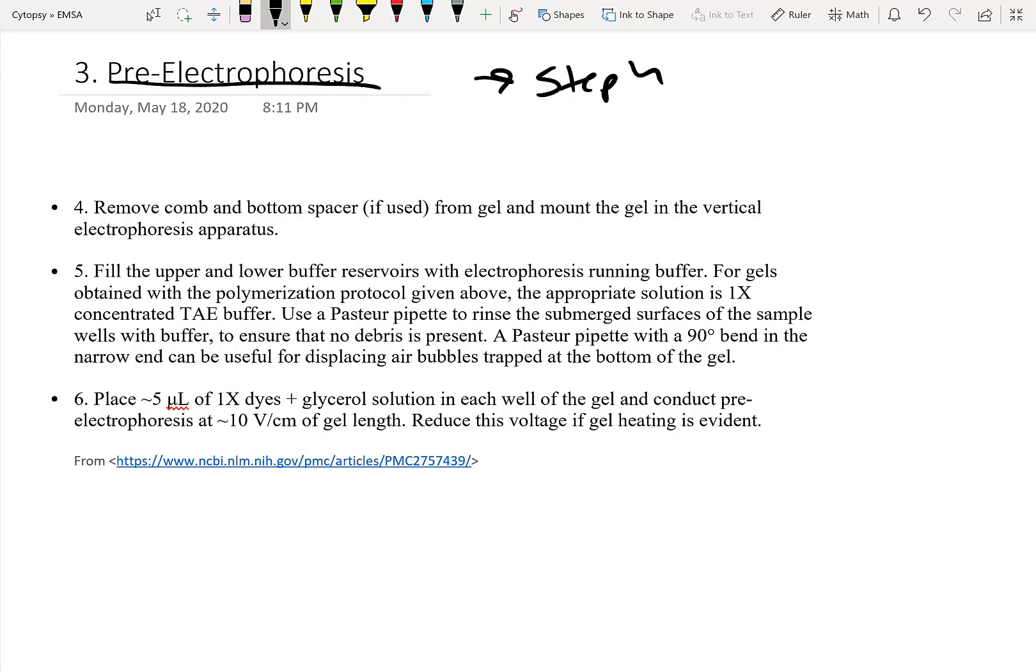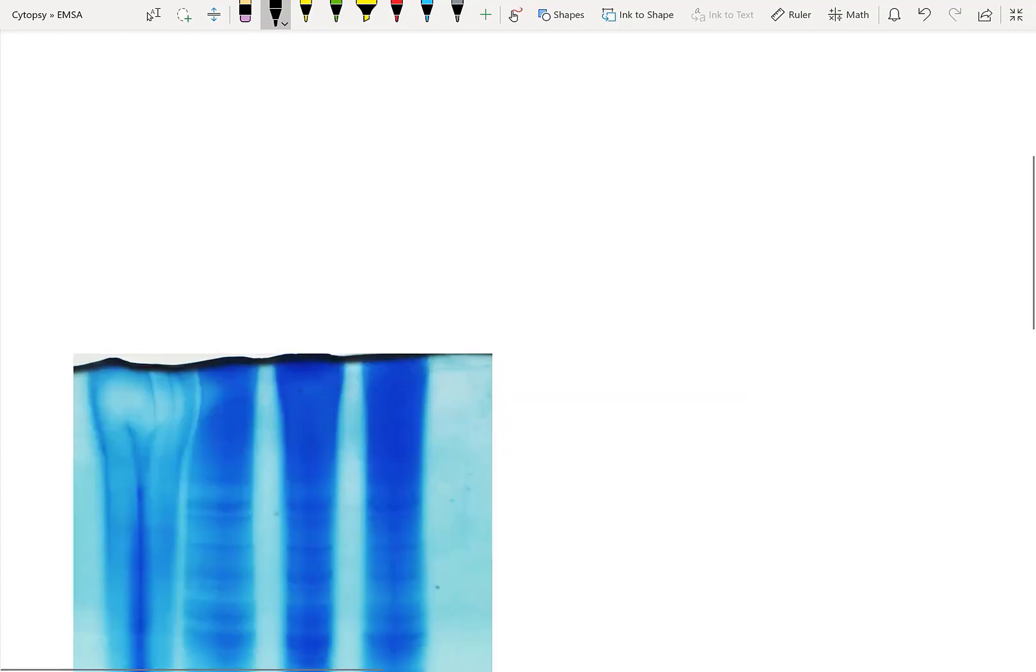This nature methods protocol suggests doing some pre-electrophoresis while we're preparing the samples. Pre-electrophoresis - the idea is you can run something like dyes with glycerol just to see if your gel has formed properly. Running a gel once doesn't break it down, and in this case we're just running glycerol solution, so it doesn't really affect any samples you're going to load later. This is what they're trying to avoid - you don't want to see lanes that are actually malformed like this one. Another reason you might want to run pre-electrophoresis is if you wanted to distribute something throughout the gel, such as cyclic AMP. But that's very protocol specific.